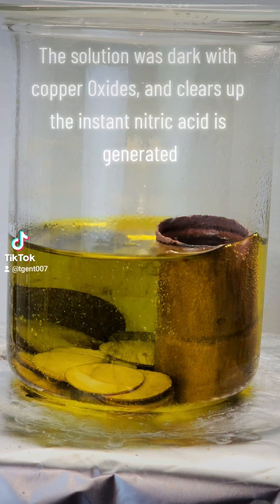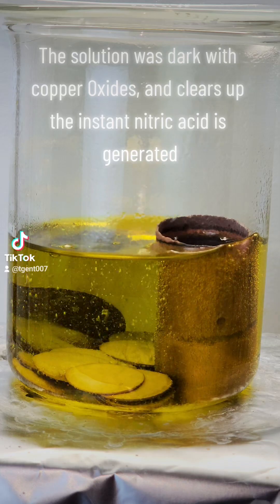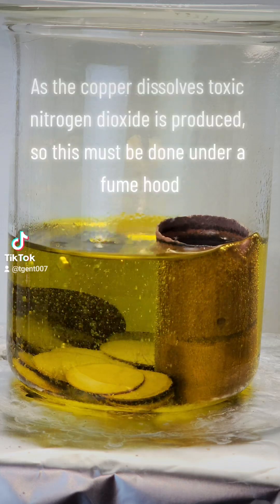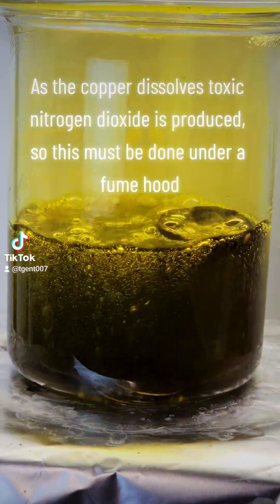The solution was dark with copper oxides and clears up the instant nitric acid is generated. As the copper dissolves, toxic nitrogen dioxide is produced, so this must be done under a fume hood.